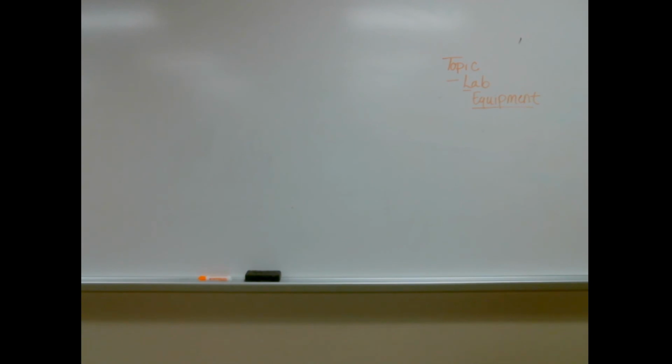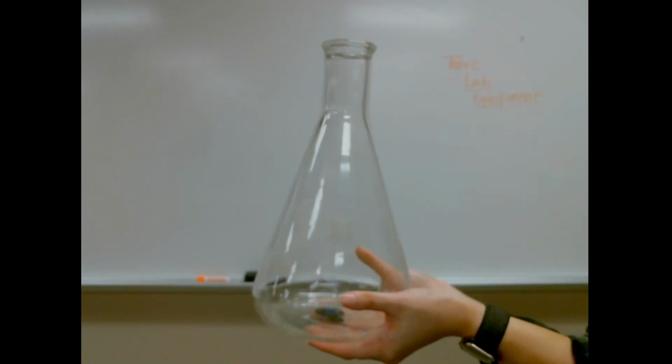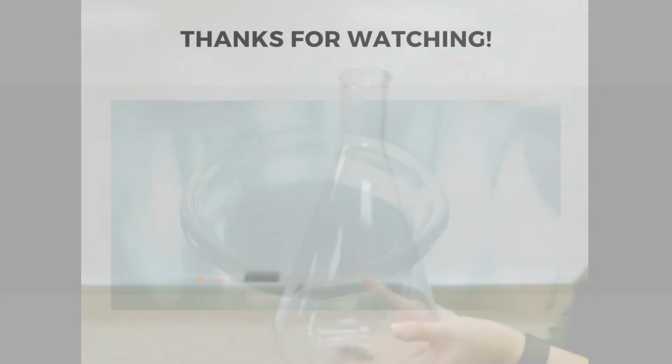And lastly, we have an Erlenmeyer Flask. The purpose of this type of flask is to store and mix chemicals.